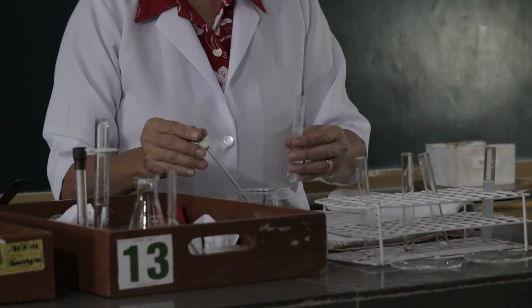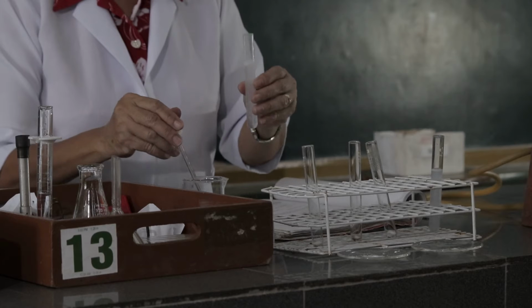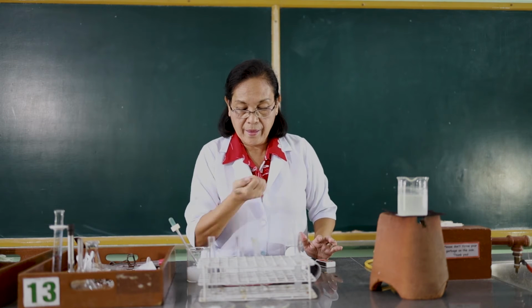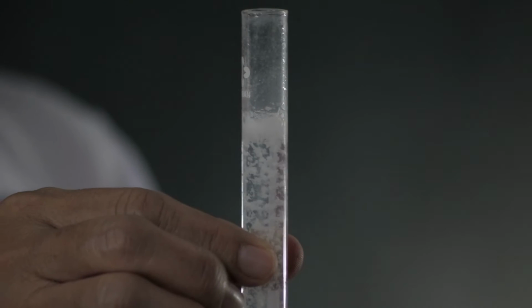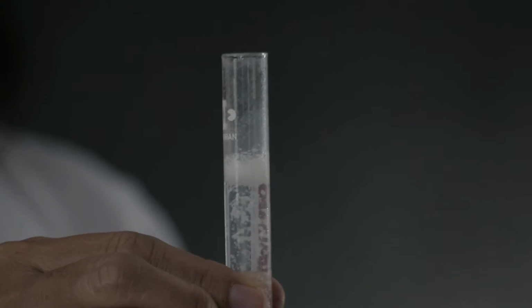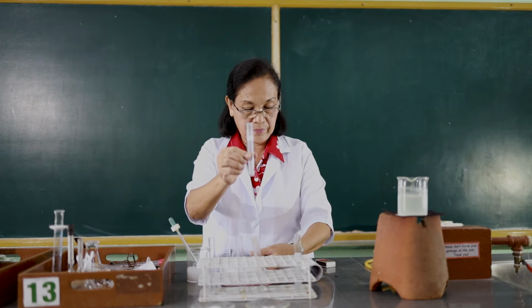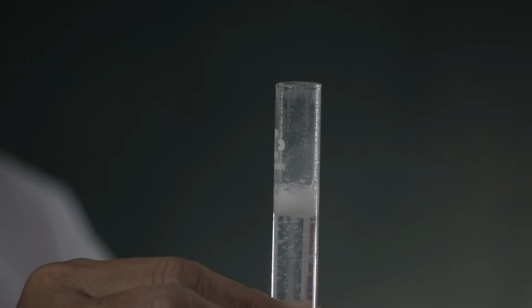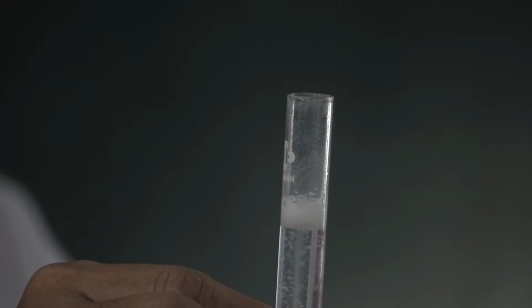That's one. Okay, there are already bubbles formed on top of the liquid, and let us observe whether these bubbles will not burst for at least 1 minute. And 1 minute had passed. The bubbles are not burst out, so this is already considered a good lather.